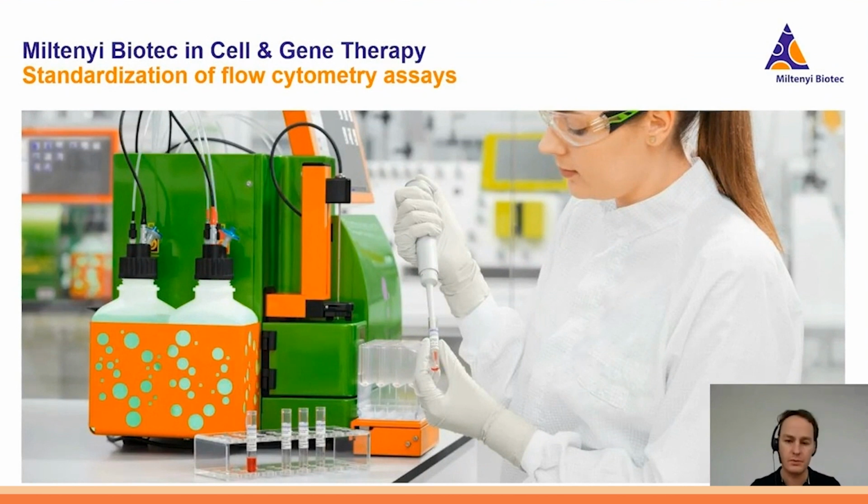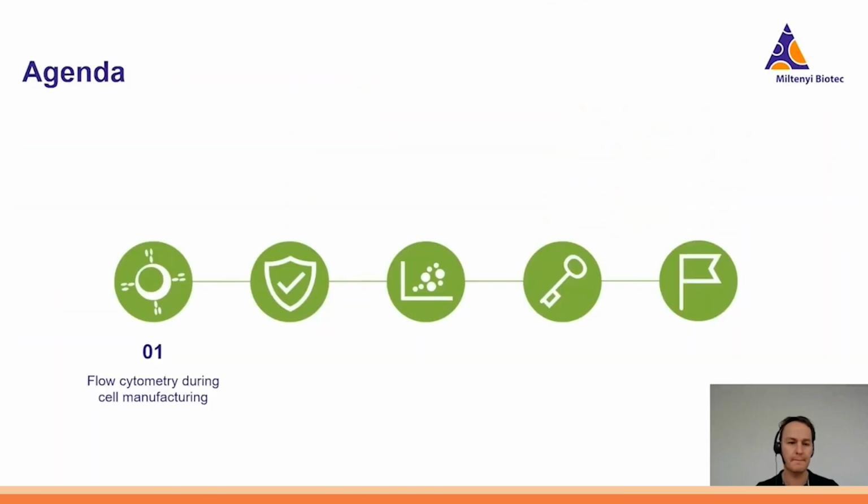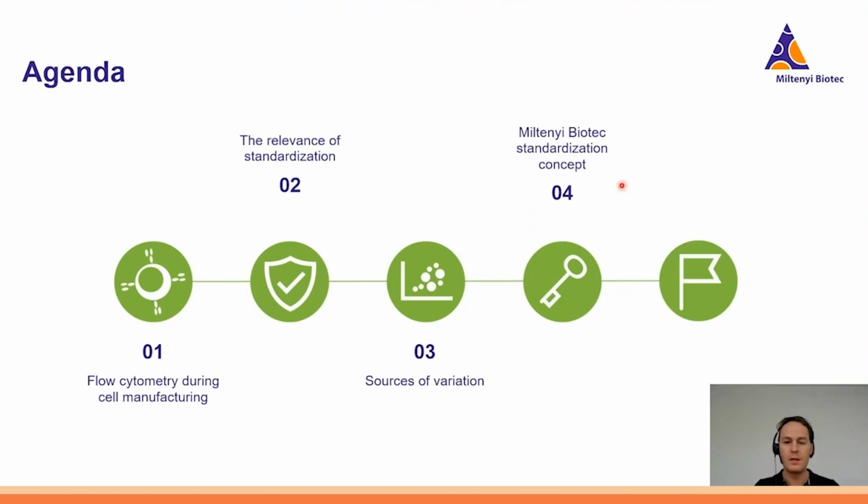My name is Masilius Moos, and I'm with Miltenyi Biotec, and today I would like to present what we can contribute on the standardization of flow cytometric assays. I would like to start with a short agenda. First, I would like to show where flow cytometry resides during cell manufacturing. Then, of course, the relevance of standardization. What are different sources of variation? What is our contribution to reduce these variations? And then, of course, a short summary in the end.